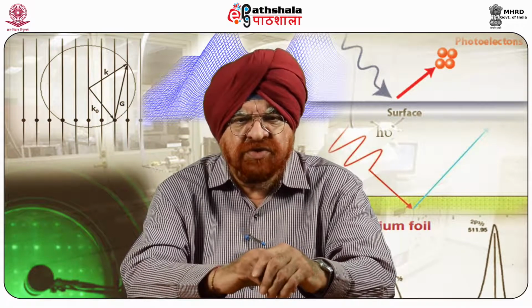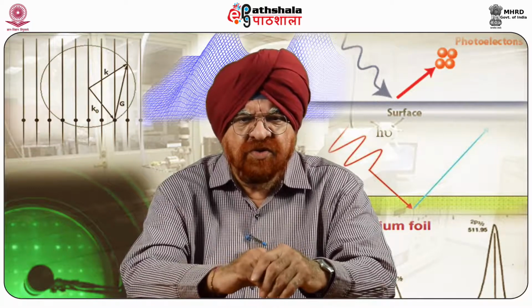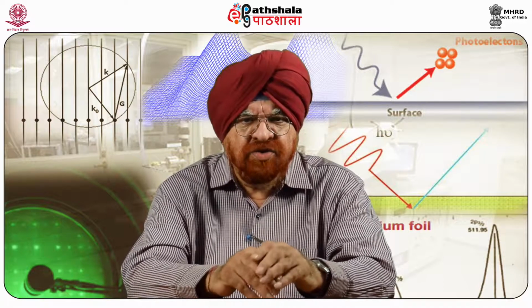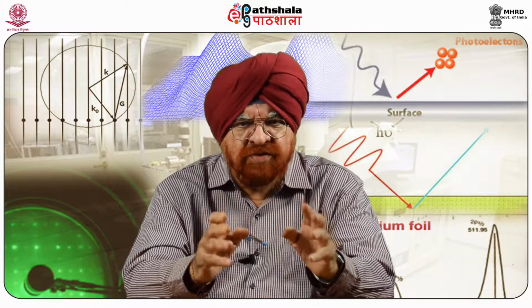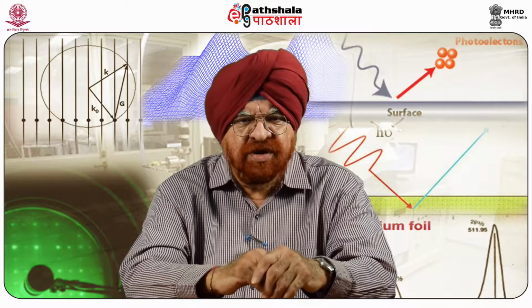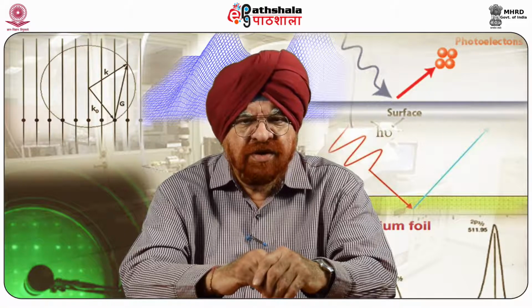MFM can be used to image several magnetic structures, which include domain walls, Bloch and Néel walls, closure domains, recorded magnetic bits, etc. Moreover, motion of domain walls can also be studied in an external magnetic field.